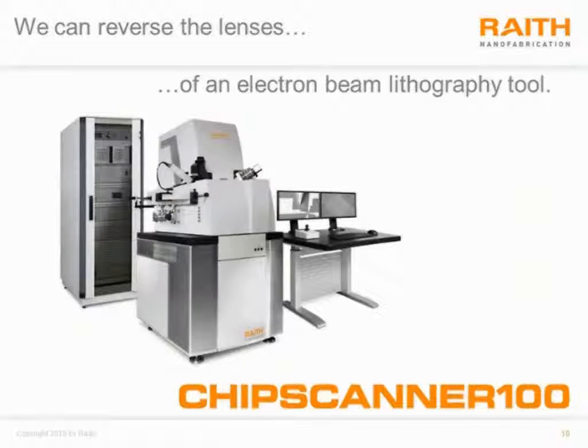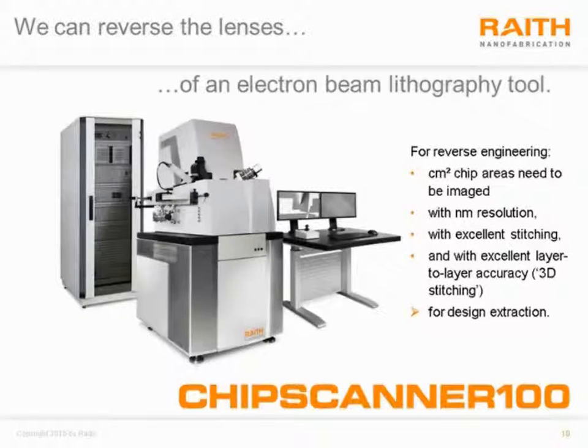So, by reversing the lenses of an electron beam lithography tool, we therefore have what we call the chip scanner. And this chip scanner is a scanning electron microscope that can image areas over centimeter squared areas with nanometer resolution.